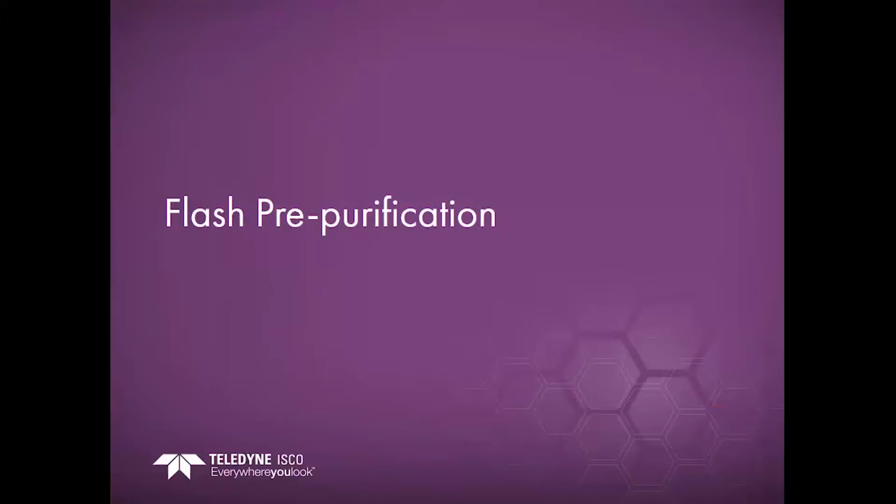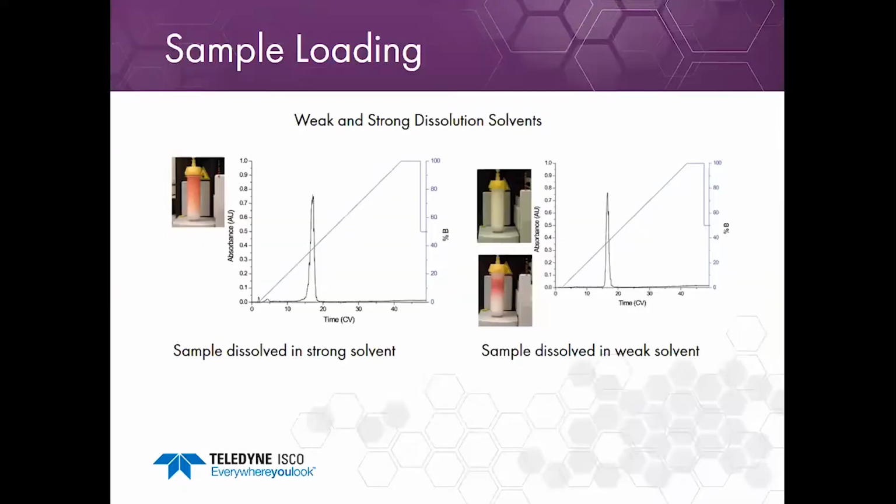We talk about flash pre-purification now, and we will also apply the mass-directed fractionation to flash chromatography. Again, I'm going to step away from peptides for a few minutes and talk about how you dissolve your sample and how that plays a role in the purification of your peptides.